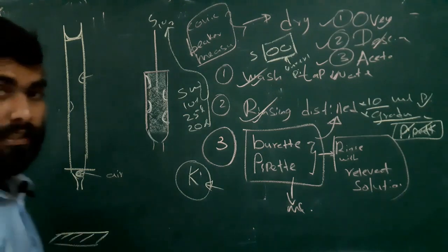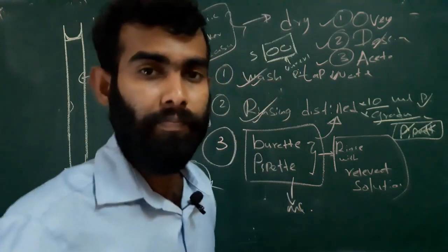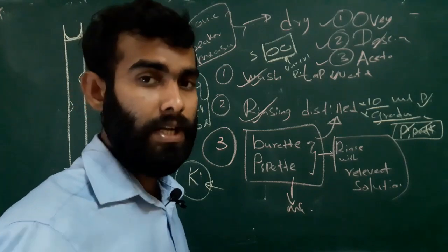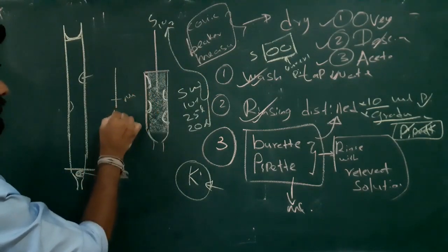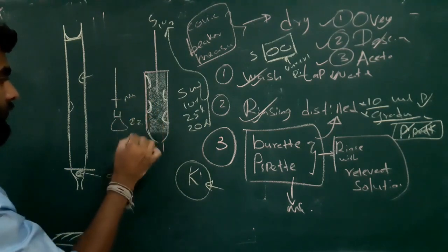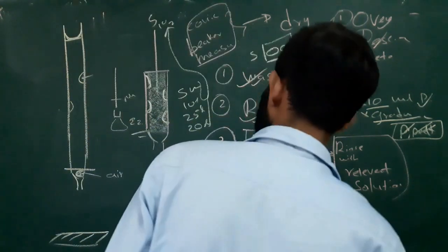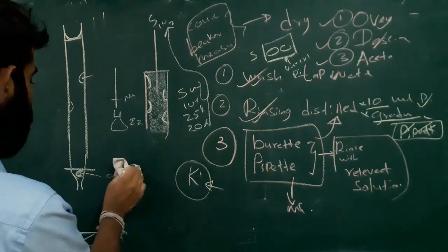So what will be the experiment's observation? What will we be using as the indicator of this experiment? Titration. When we use sodium thiosulfate and iodine, what will be our indicator?